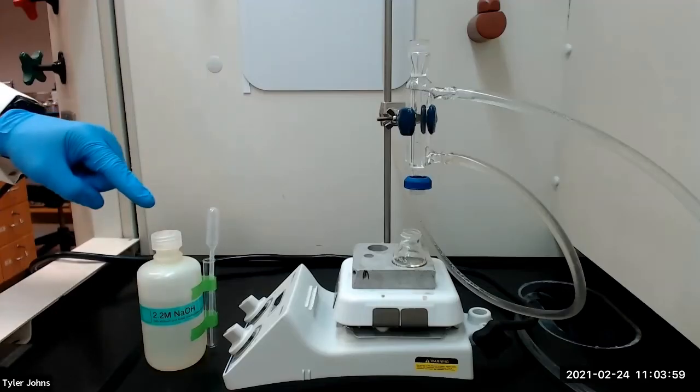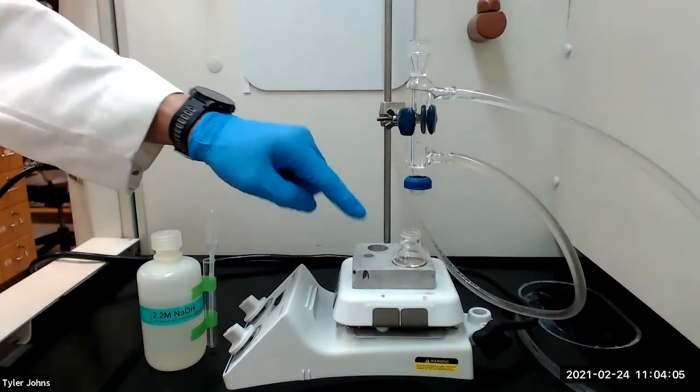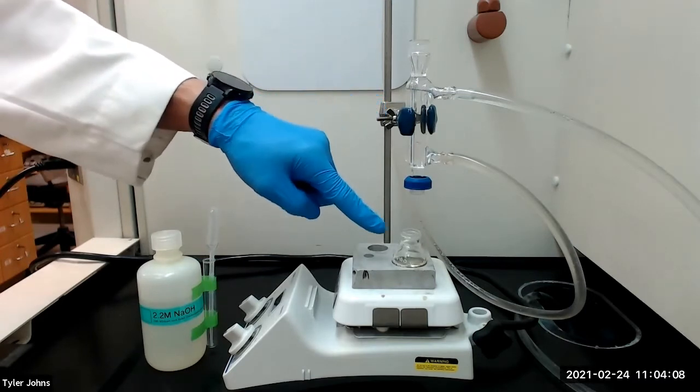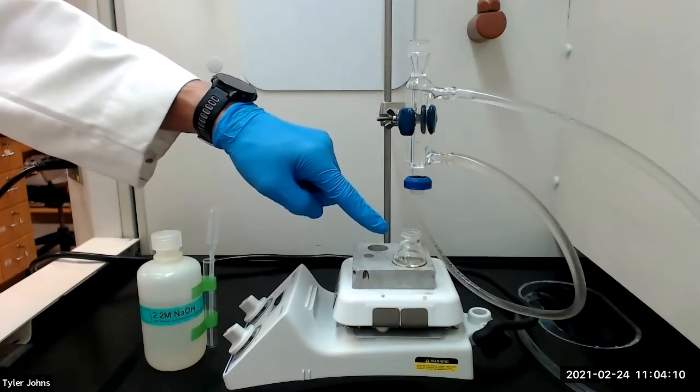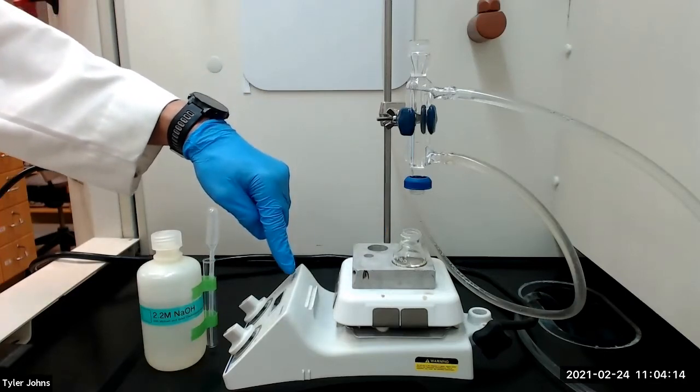We will next add 0.25 milliliters of 2.2 molar sodium hydroxide solution to the mixture. We will then attach a water-cooled condenser to the 10 milliliter round bottom flask and heat the mixture to reflux using an aluminum block and a hot plate.